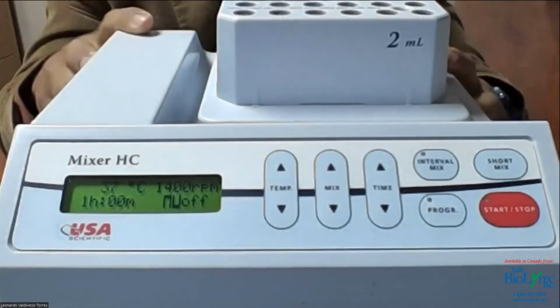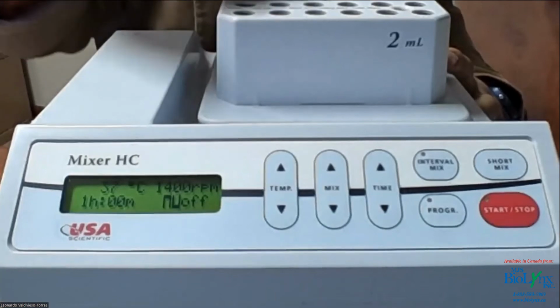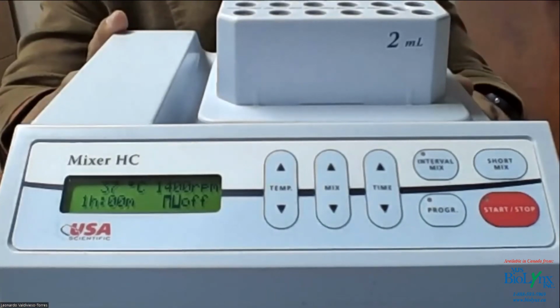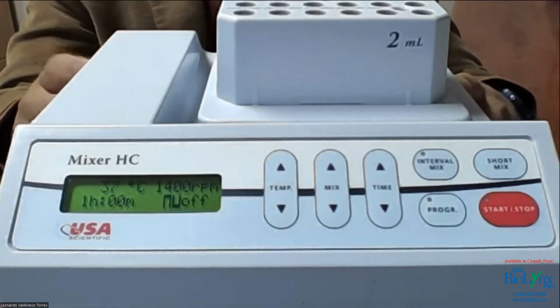I would not have it in, because if you want to use the mixing capabilities, my experience is that there's going to be somebody who tries to put tubes in and mix with the thermometer on, and you never know if it can break there. I don't want to deal with that breaking into the machine. All right, I hope that answered your question, Don.